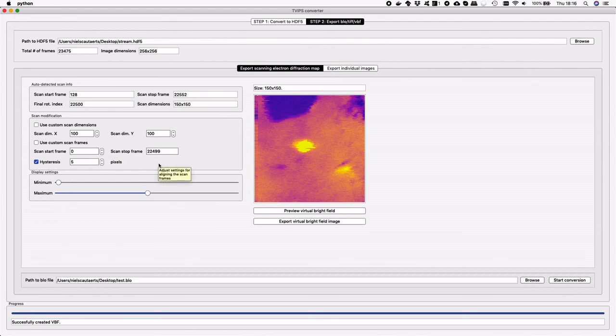And that's it for this video. I hope you found this helpful, and I hope this allows you to convert your TVIPS data into other formats.